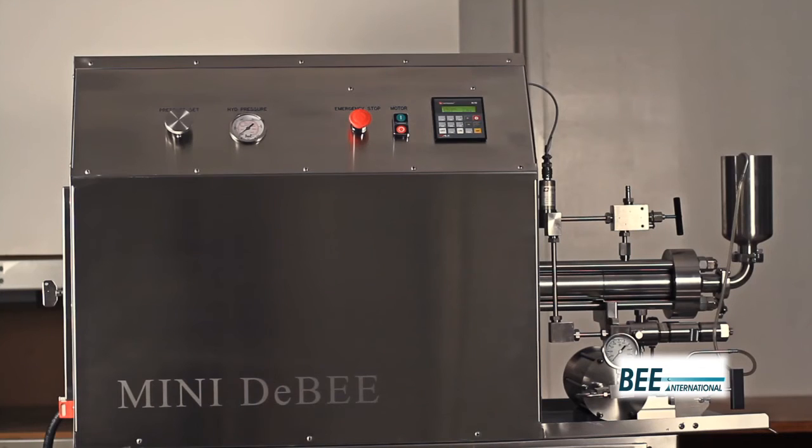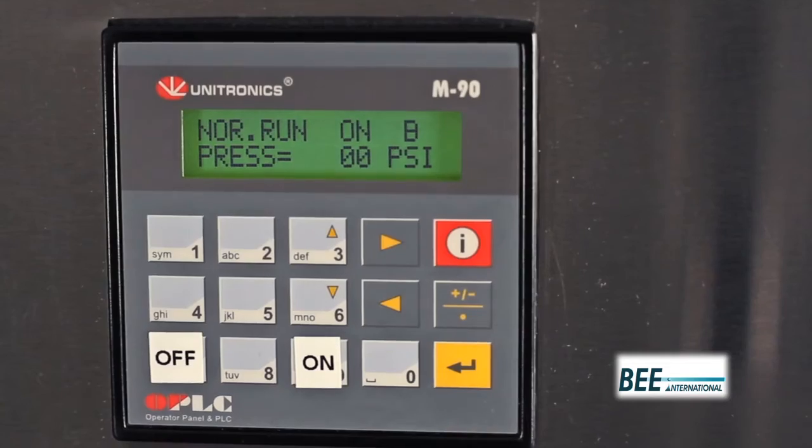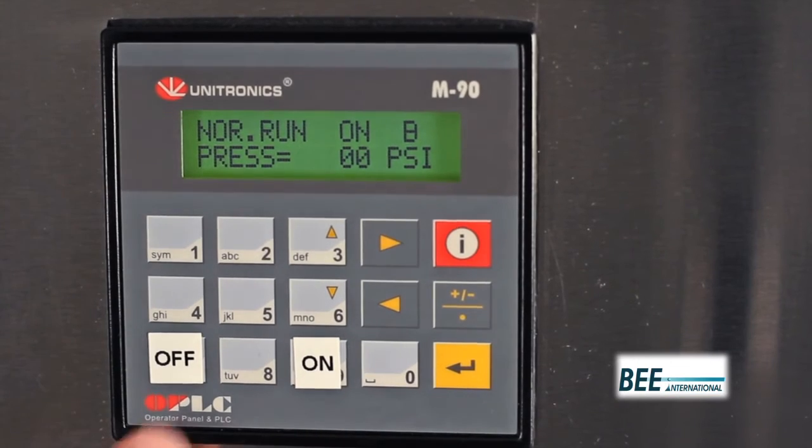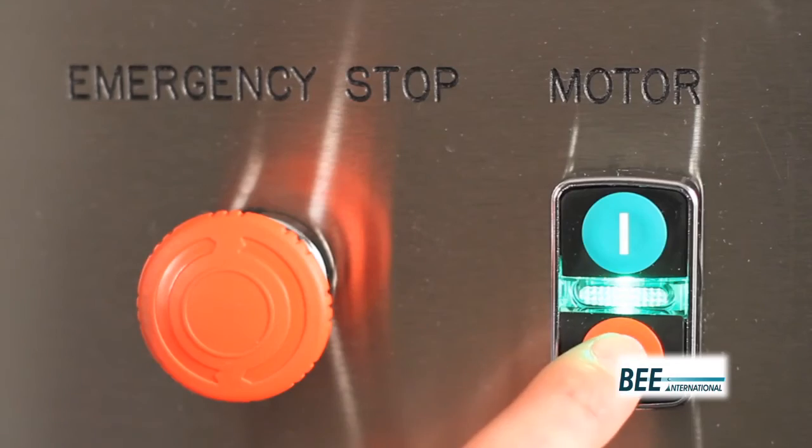At the end of operation, turn the pressure set dial counterclockwise until process pressure reads zero and press off on the PLC to turn off the intensifier pump. Then turn off the motor button.